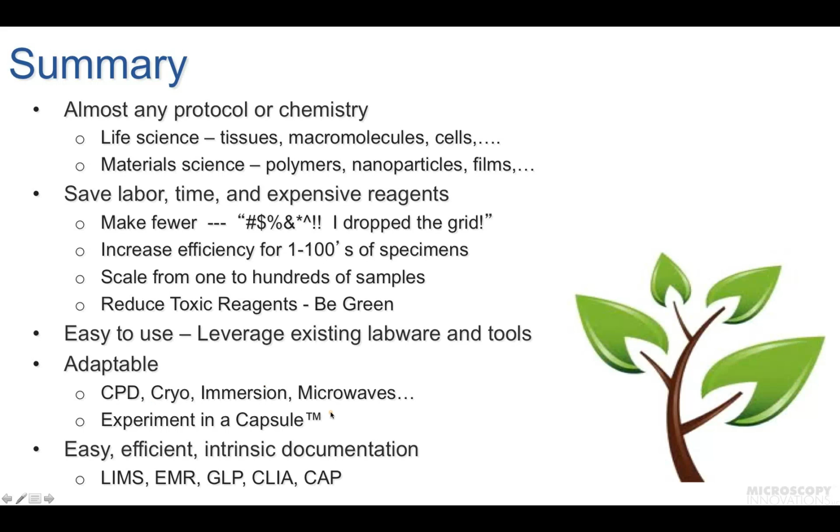For example, the study that I showed of the negative staining of DNA RecA complex was to some extent an experiment in a capsule because the adsorption was done in there. And the same with the nanoparticle example where we were able to do some treatment of the specimen within the capsule. And one could extend this into more complicated experiments.